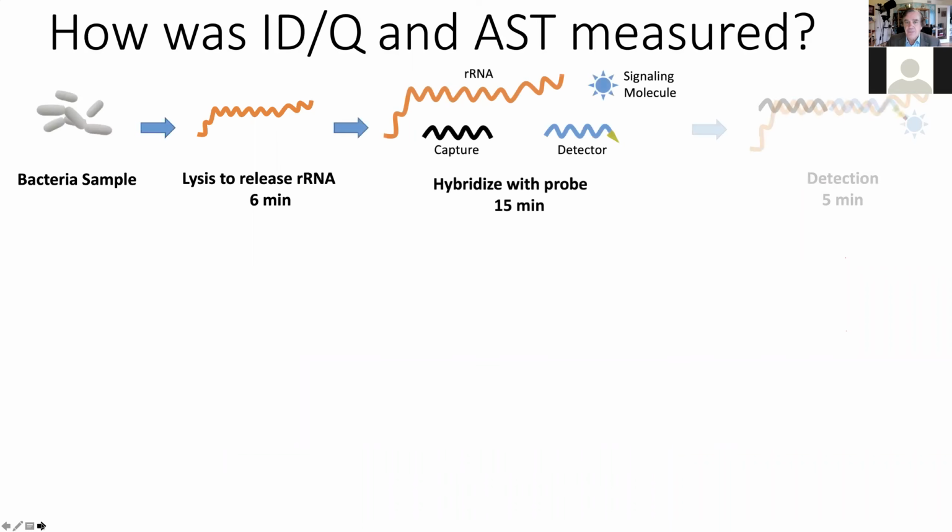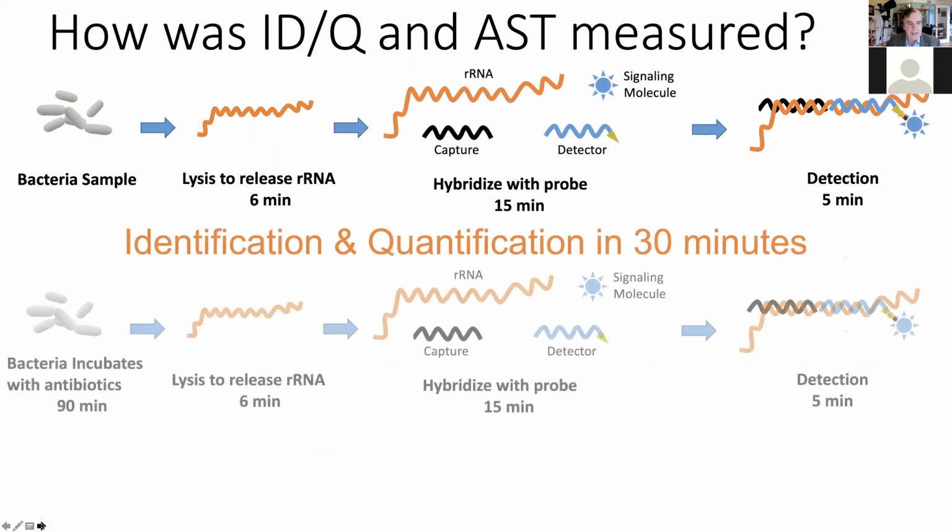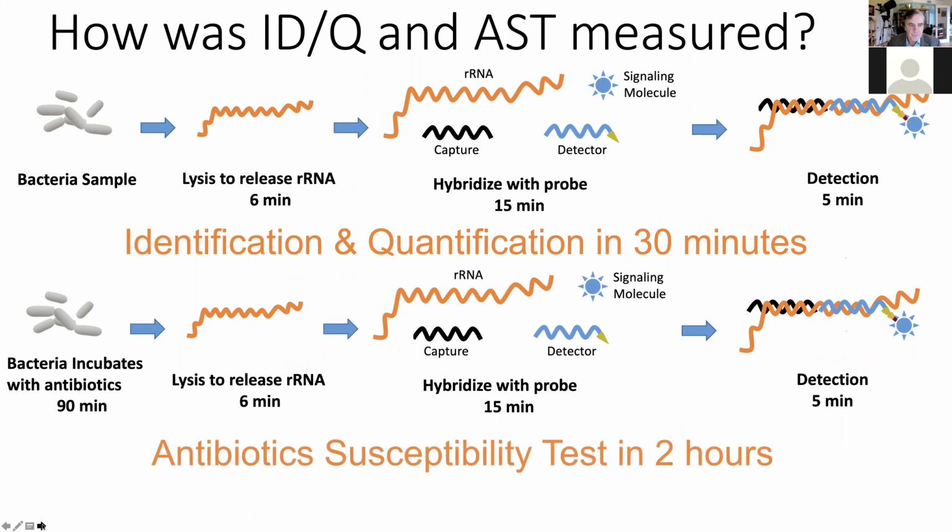The assay. I guess this is the most important slide, and then how we translate that to the assay on the CD. Okay, so the top structure is the identification and quantification, which we do in 30 minutes. So let's go over that first.